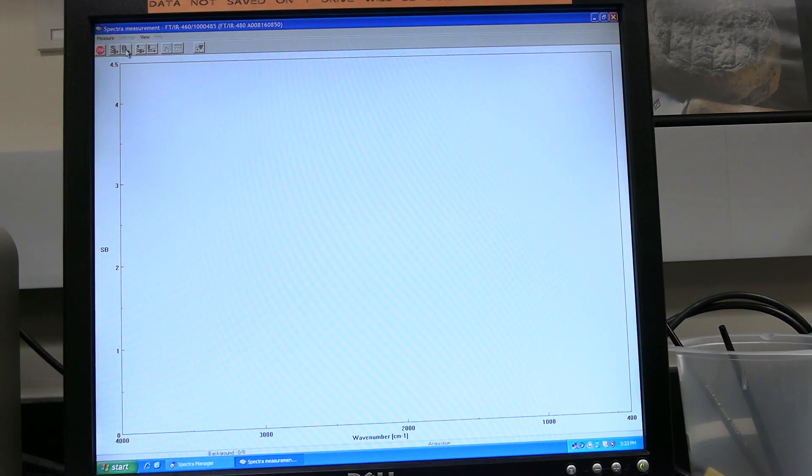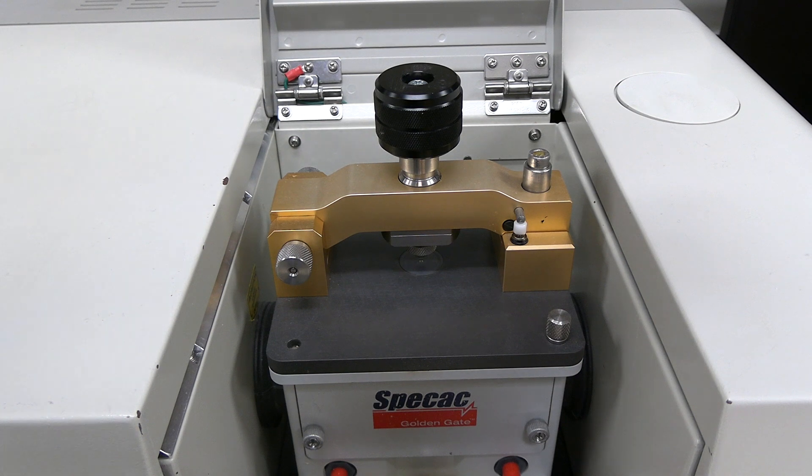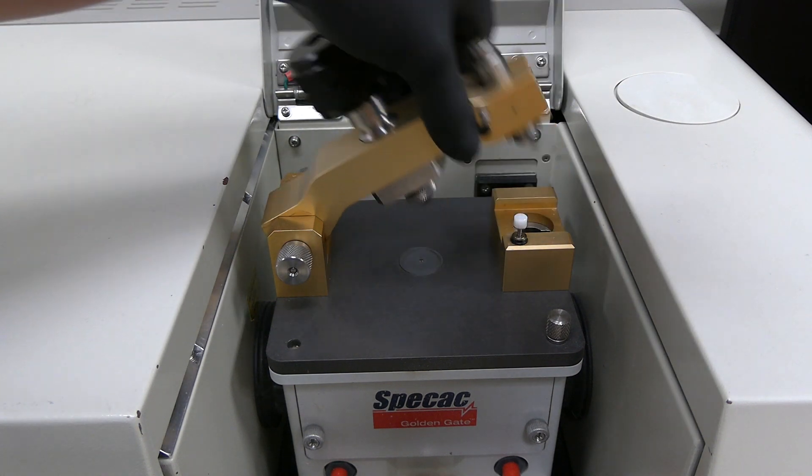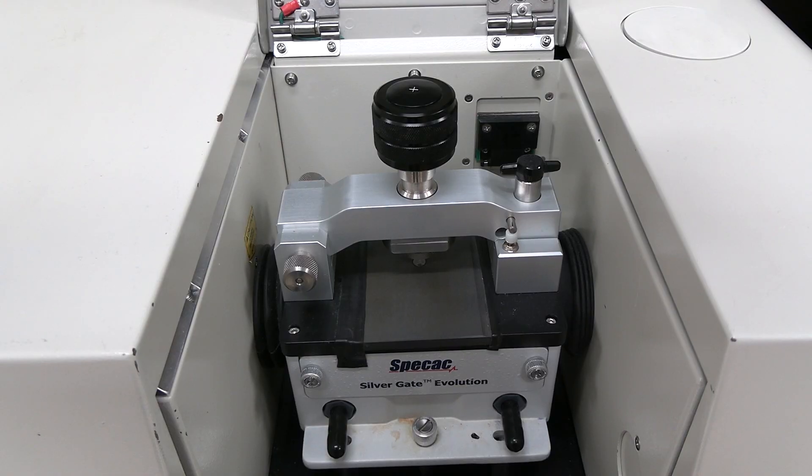Click on the background button and wait for the background measurement to finish. Place sample in the sample chamber. If using the ATR, start by lifting the anvil arm. Remember, the ATR may look different but functions the same.